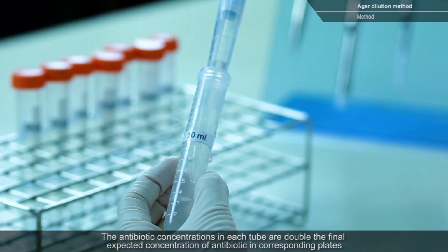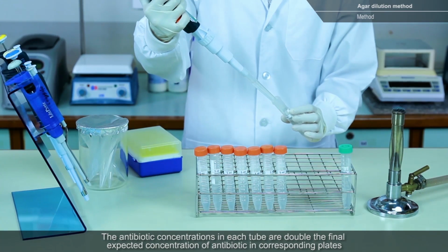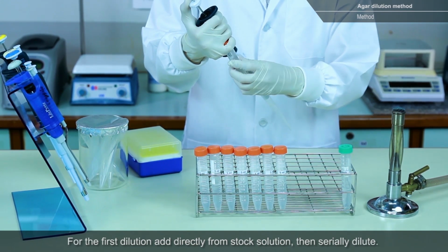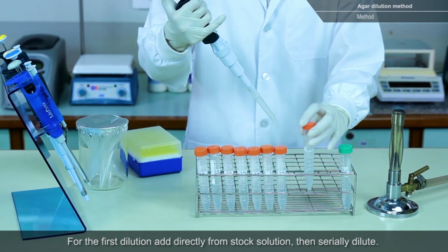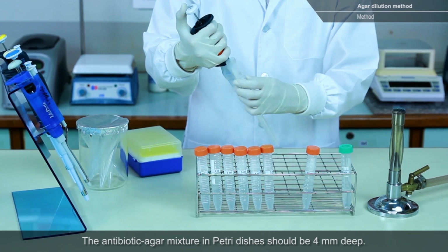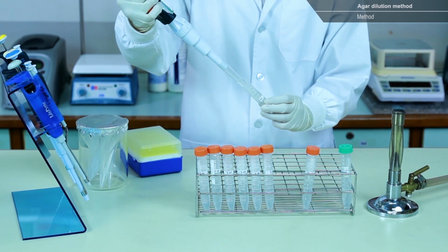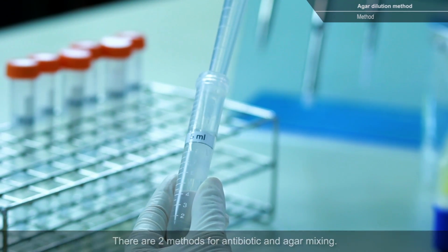The antibiotic concentrations in each tube are double the final expected concentration of antibiotic in corresponding plates. For the first dilution, add directly from stock solution, then serially dilute. The antibiotic agar mixture in petri dishes should be 4 millimeters deep. There are 2 methods for antibiotic and agar mixing.